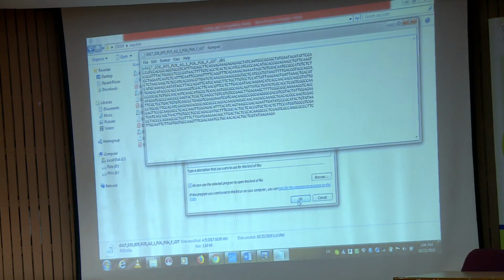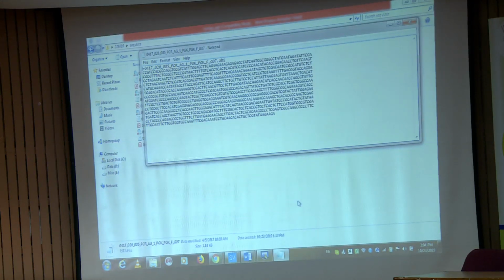The company will say that okay, this is the FASTA format of the sequence, this was your sample name, this was your primer name, PGK forward, okay, and this is the sequence which the company is providing. But never ever go forward with this FASTA format for analysis, because they are saying that this is ACGT, but how good that particular base is, you do not know, right.